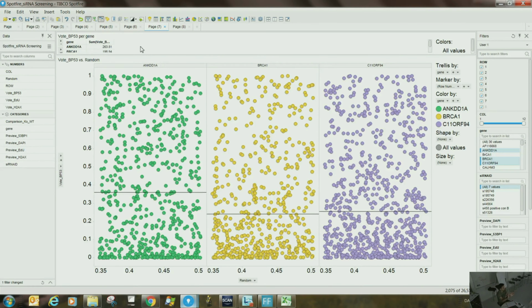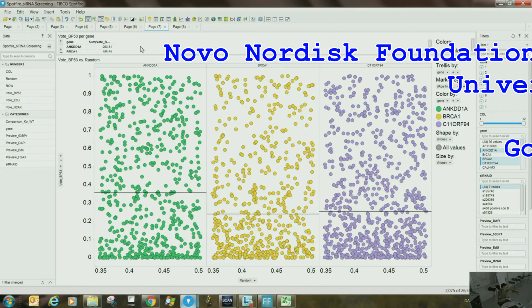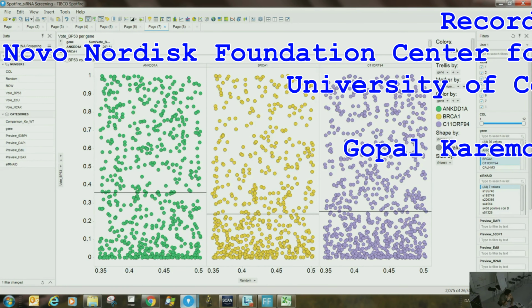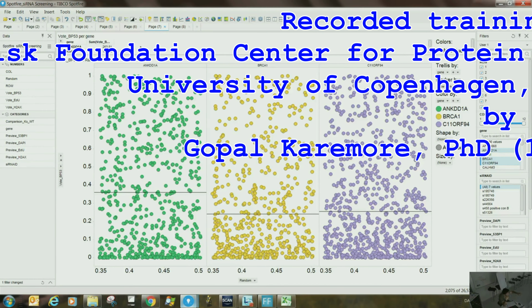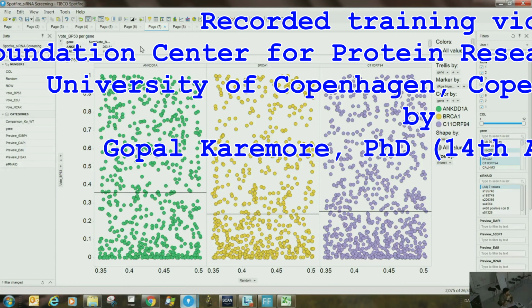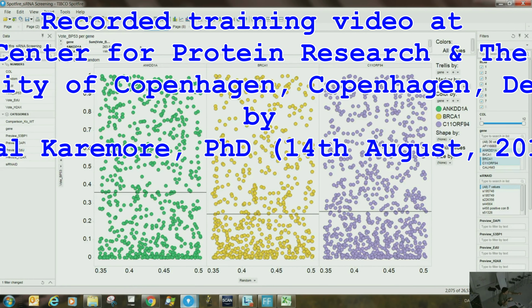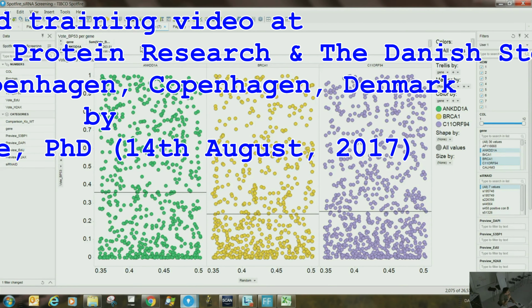No, cyclin A is better because it's just nucleus. Oh, okay. Then just outside, compute the mean value of cyclin B1, so cyclin A, to the DAPI, and then you have DAPI here, and then cyclin, and this. So you have actually two of these things, the thing that you just described. Yeah, the profile. But for the profile, you have to have the time axis. I mean, if you have enough such continuous variable, then that can also be considered as a time. But most people select on the DAPI only, or do they do additional stuff?